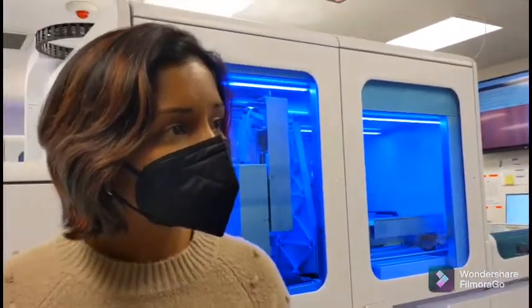Yeah, exactly. So can you share the percentage that we've seen so far of Omicron compared to Delta, which is still predominant? Yeah. Share the 15% or whatever. Yeah, so the initial cases, after a period of a few days of not having too many potential Omicron cases, we started to see that number slowly tick up. I think we saw on one day we had about 3%, and then it became 6%, and then it was 13%. That was what we reported a couple of days ago. And then as of yesterday, that went up to 20%. So that trend is definitely holding up so far.